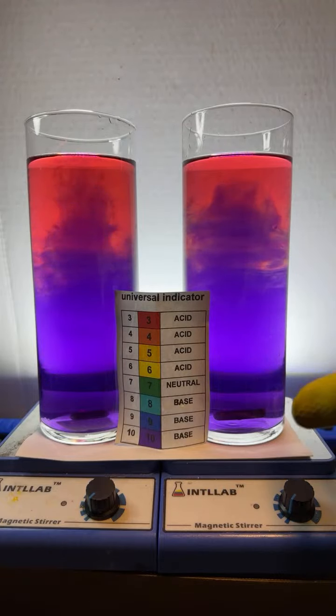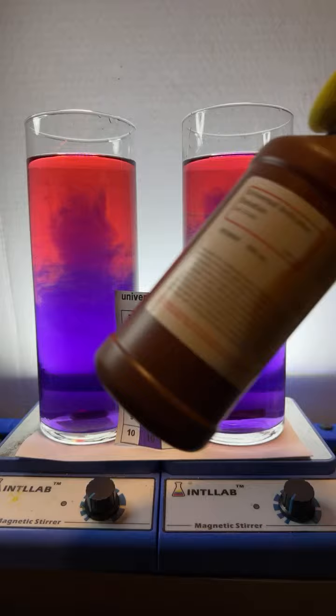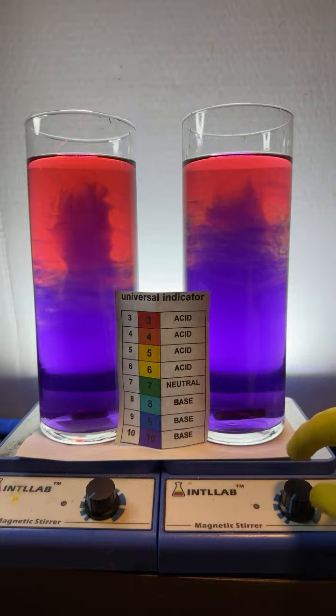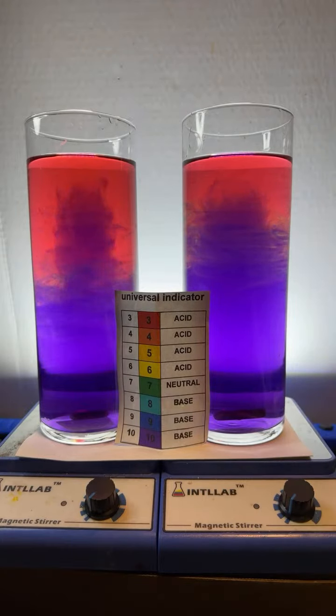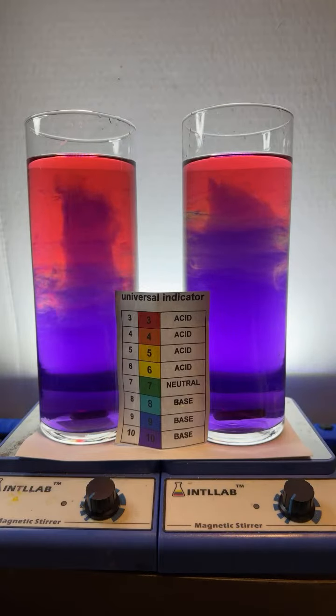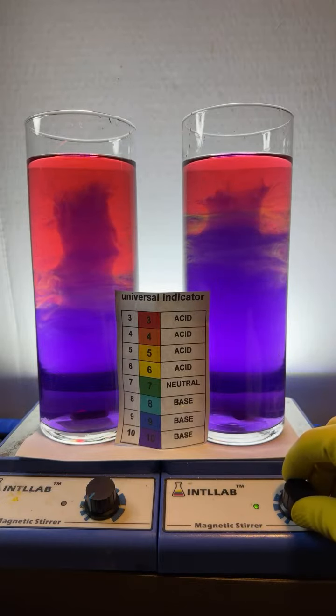How do you make this pH show? All you need to do is get some universal indicator. You usually buy this from science supply houses. You're going to get yourself a flask, a magnetic stir bar, and a stir plate. And then you're just going to add either hydrochloric acid or sodium hydroxide. Try to put acid in the middle while it's spinning, all right? We'll try it. Here we go.